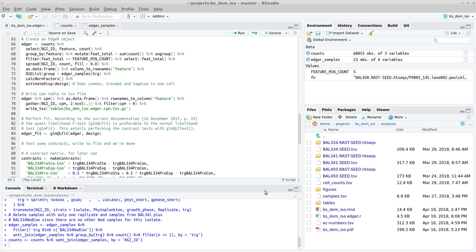in a single table. A single table which has all the information, the name of the gene, the log FC, the log CPM, the FDR, but also the name of the contrast. So instead of having multiple tables, one for each contrast, this analysis will end with just one.